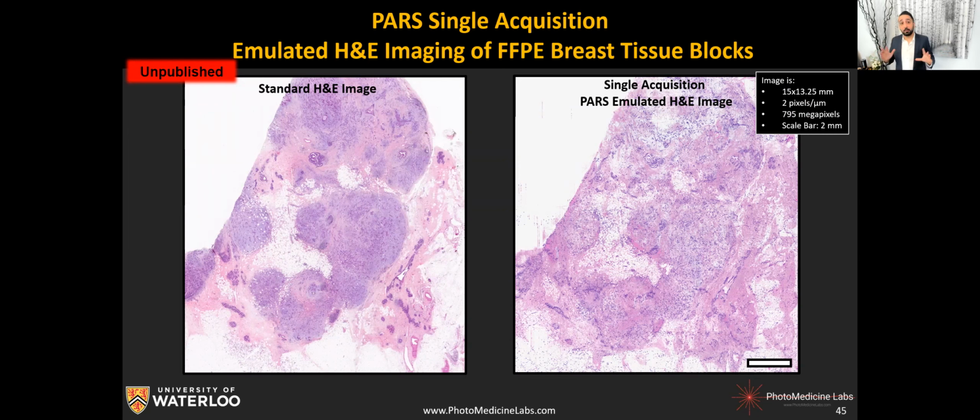So I mentioned we can do H&E images using one single excitation, and by taking advantage of the fact that the detection also absorbs light, and also gets some level of contrast for us and provides us with some scattering. And this is a standard H&E from the glass slide. And again, we image the tissue block directly. The next slide, or basically the tissue block directly, and the first slide shaved went to the H&E to get H&E-like images for the first time from glass, from the tissue block, from the surface of the tissue block.